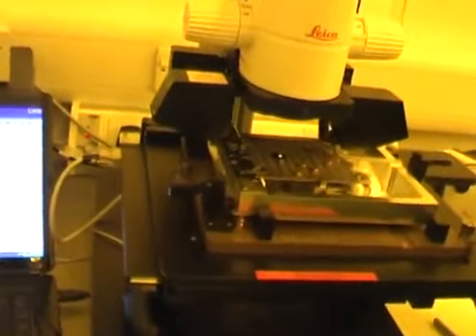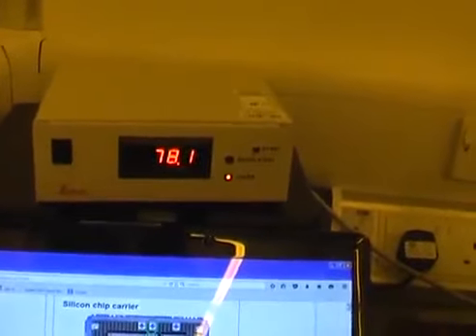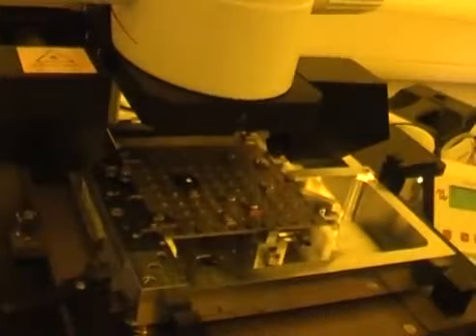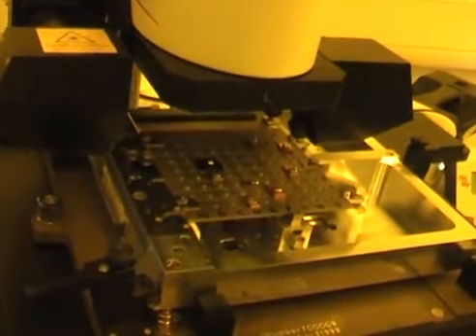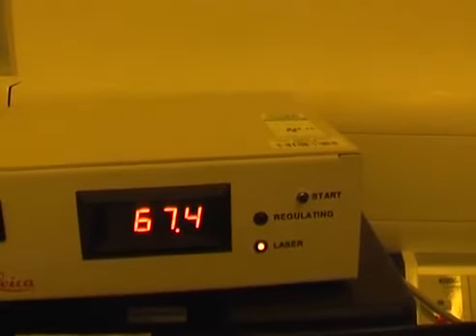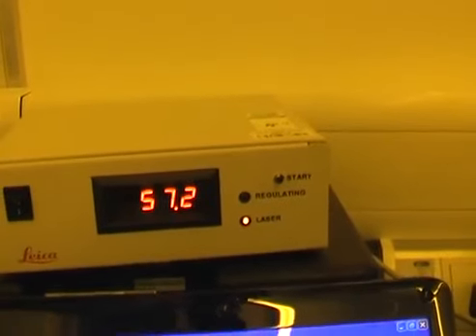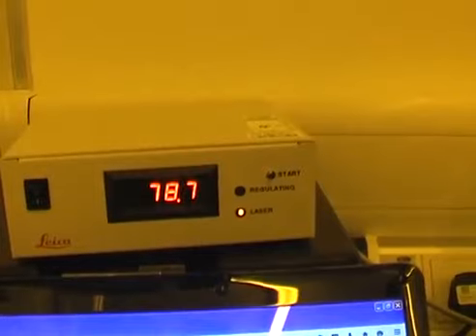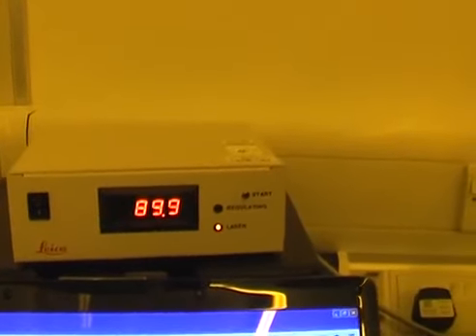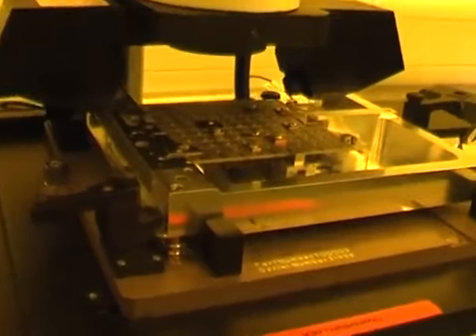So let's switch the laser back on again and move in the X direction. So it starts off at 90, and goes to about 60 microns. There's still quite a big tilt, and the height is still a bit wrong. So that suggests that an extra clamp would help. It also suggests that we really do need to change the actual height.